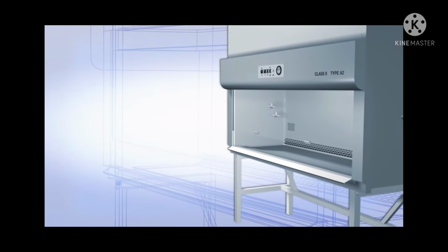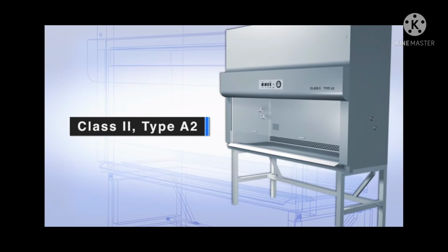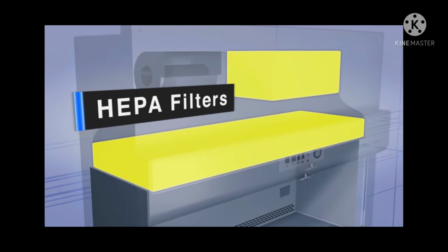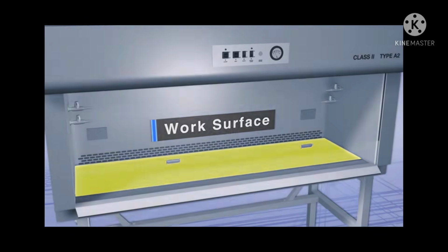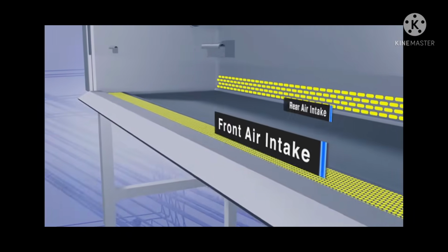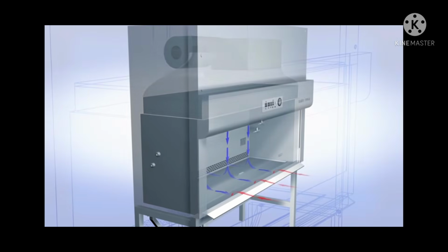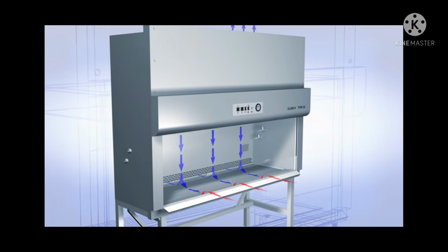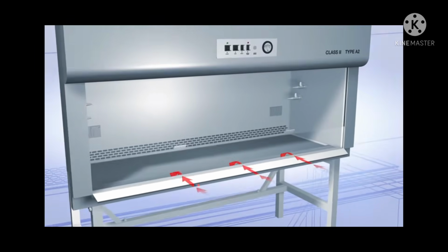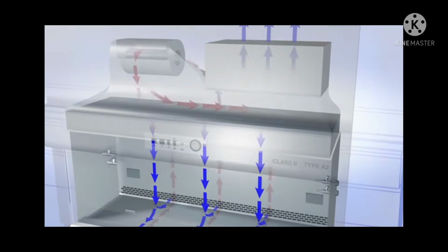This video depicts a freestanding Class 2 Type A2 biological safety cabinet, or BSC. It includes HEPA filters for exhaust and supply air, the work surface, the opening to the work surface, the airfoil, front and rear air intake grills, the plenum. The BSC's air filtration system works to keep potentially contaminated air from seeping back onto the worker. Air flows through the window opening into the front grille, through the plenum, then through the HEPA filters.